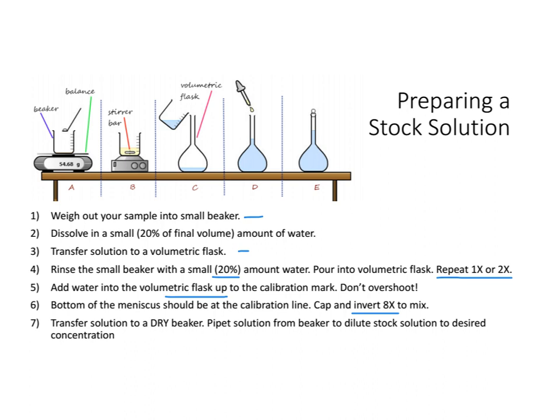Once that's done, you have to transfer it to a dry beaker, and we need to have a dry beaker because we do not want to introduce any more water into the solution. After that, you can pipette and work with your stock solution as you need.